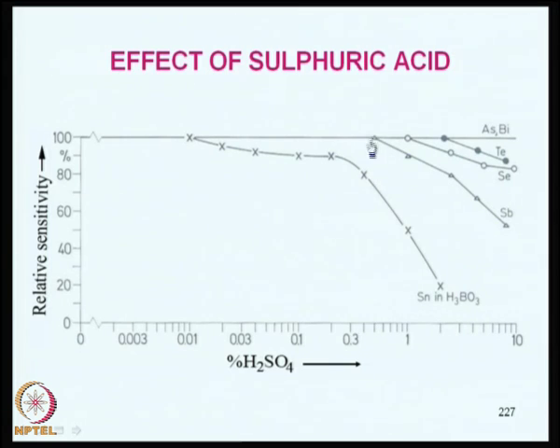Higher acidity will always give you some amount of reduction in the signal. You can construe this as interference also. So, this type of interference can be minimized by adjusting the acidity in such a way that it is always less than 1%.